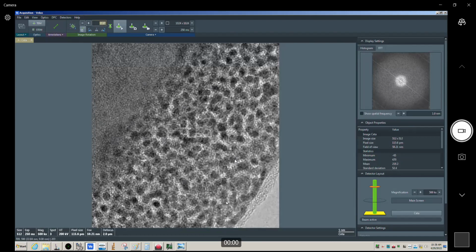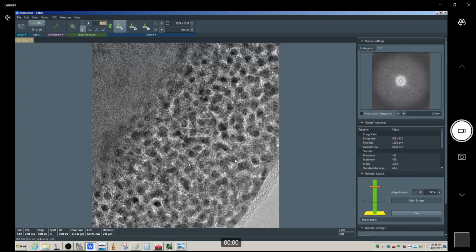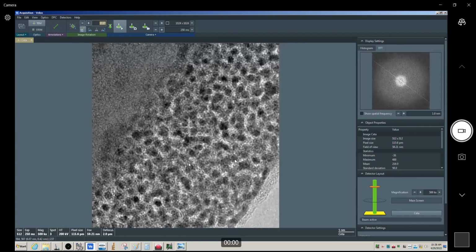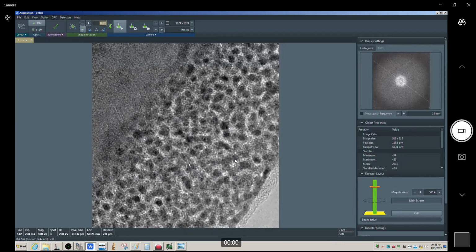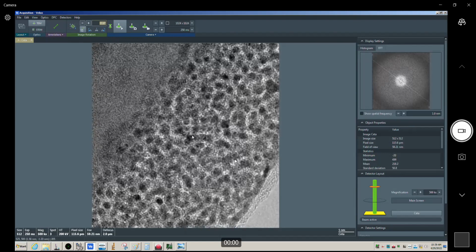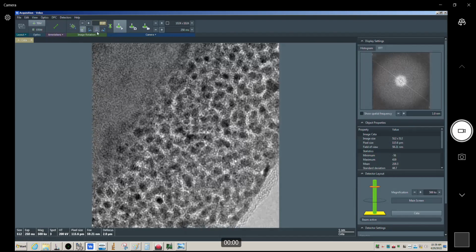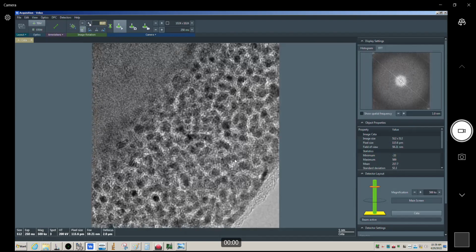The reason it's doing this is because you have to remember that your camera sensor is a perfect square. You can't change the actual physical size of your camera sensor, but you can change the number of pixels inside the sensor that are being read out for the image. As a result, if we're not going in nice 90-degree increments, we end up cropping to just the middle of the sensor. But we do have the ability, and if we just hold this down, you can see we're going in nice 1/10 of a degree increments.